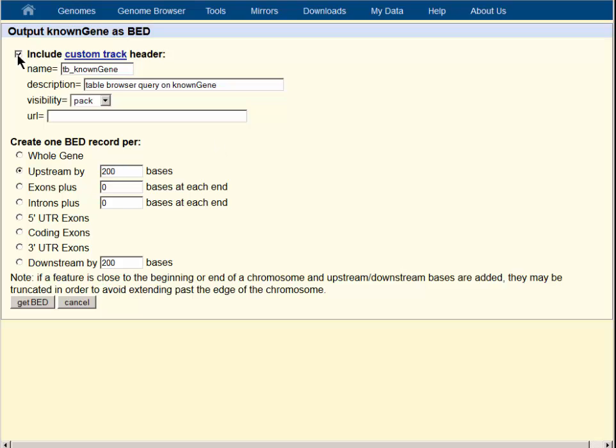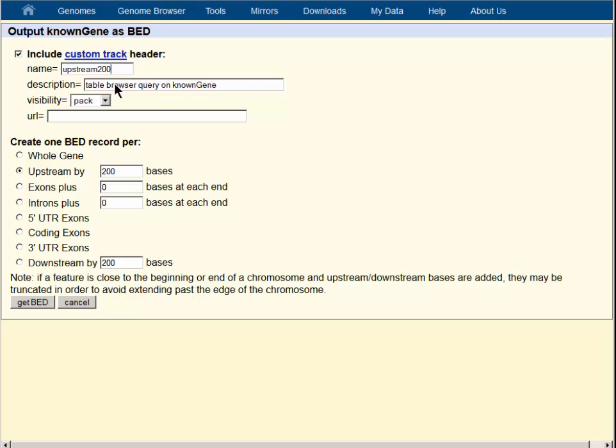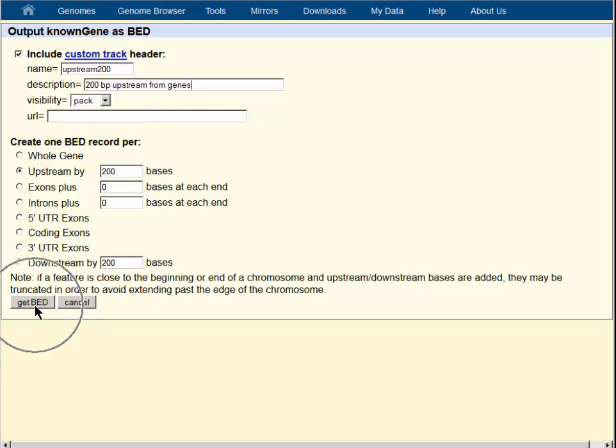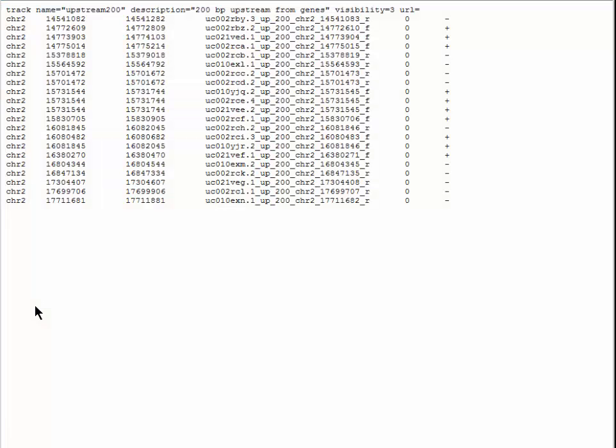We will include a custom track header, which will make it easy to copy into the custom track input page. We will name the track upstream 200 bases and call the long label 200 bases upstream from genes. Then the get bed button will take us to a page where we can see the data.